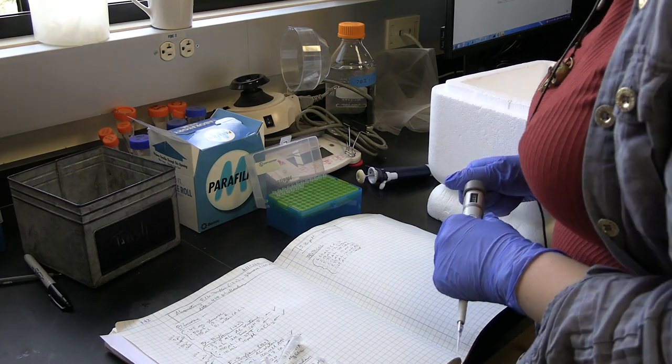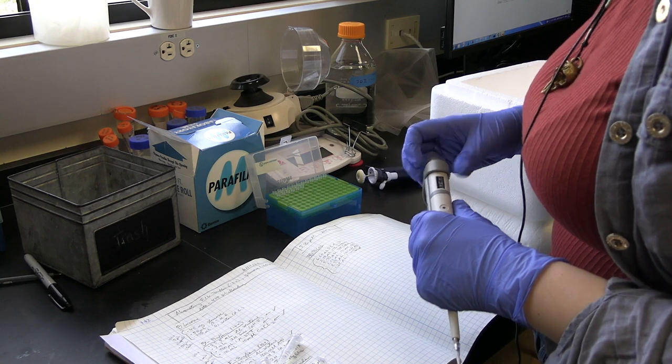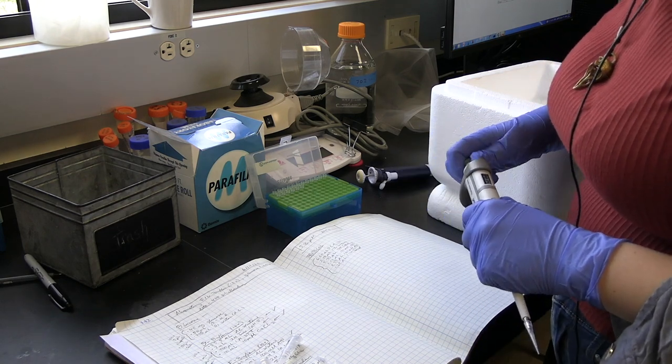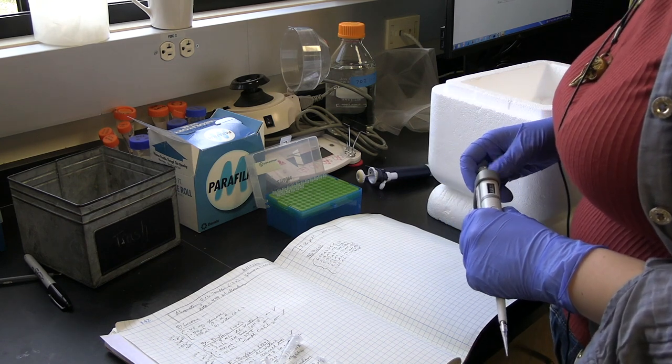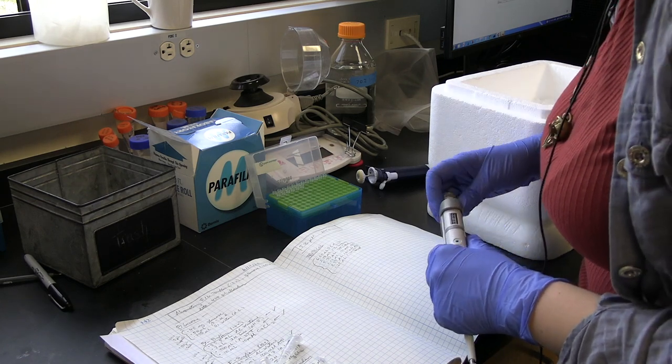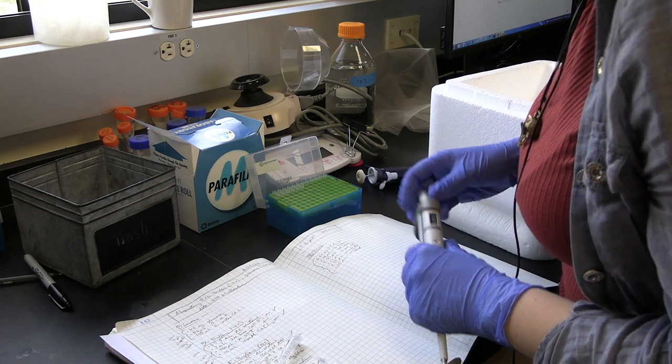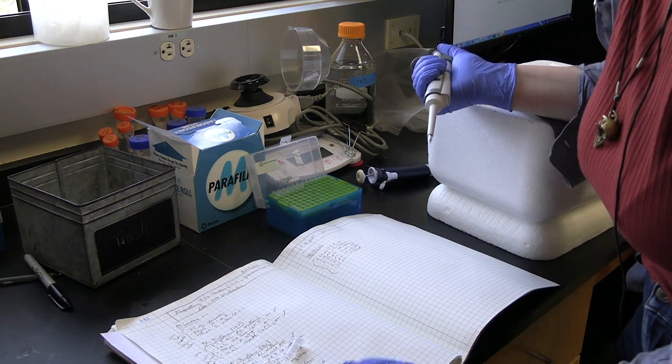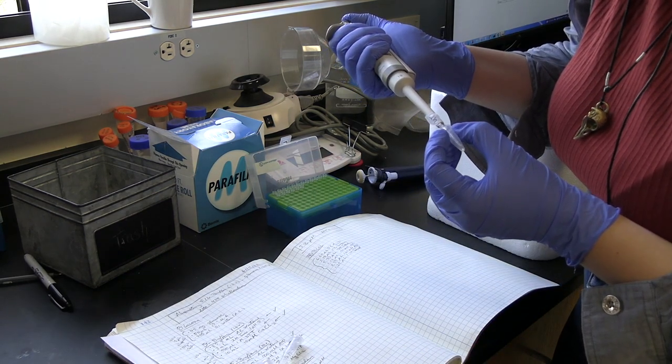Next thing we're adding is 8.33 microliters of 100 millimolar ATP. Technically you don't need ATP to polymerize microtubules. We generally add it in before polymerization so that if you have actin in our network, the actin will polymerize, and it's also going to drive the kinesin motors in our network. Adding the ATP very gently.